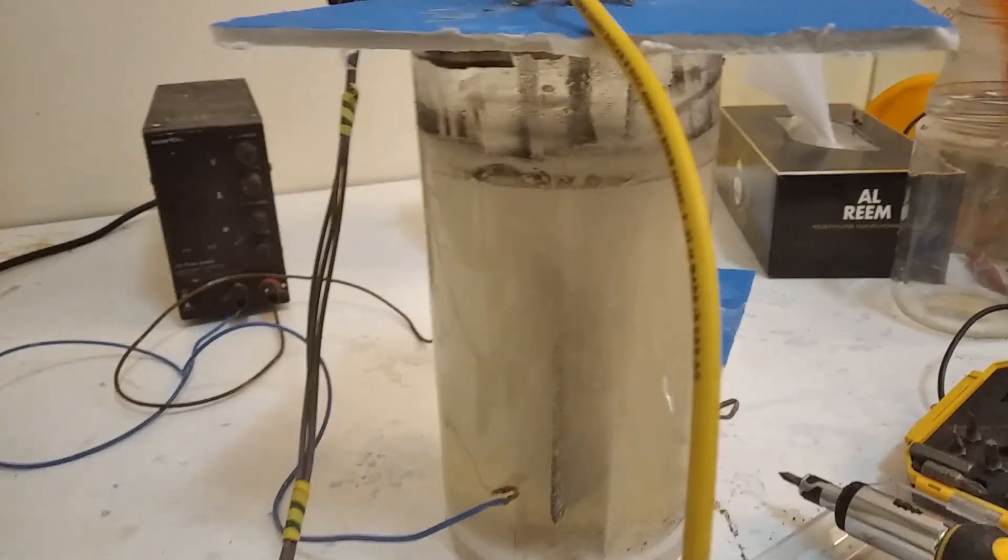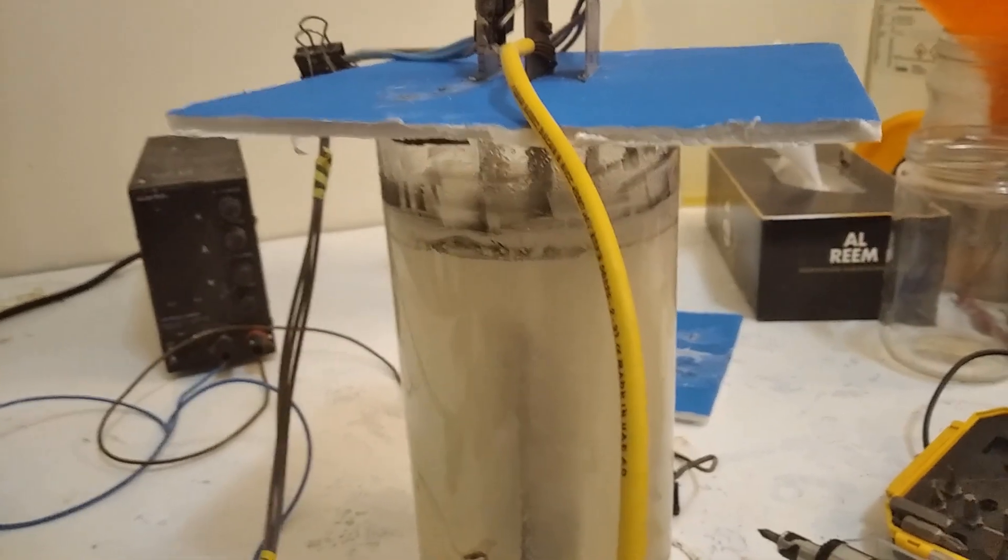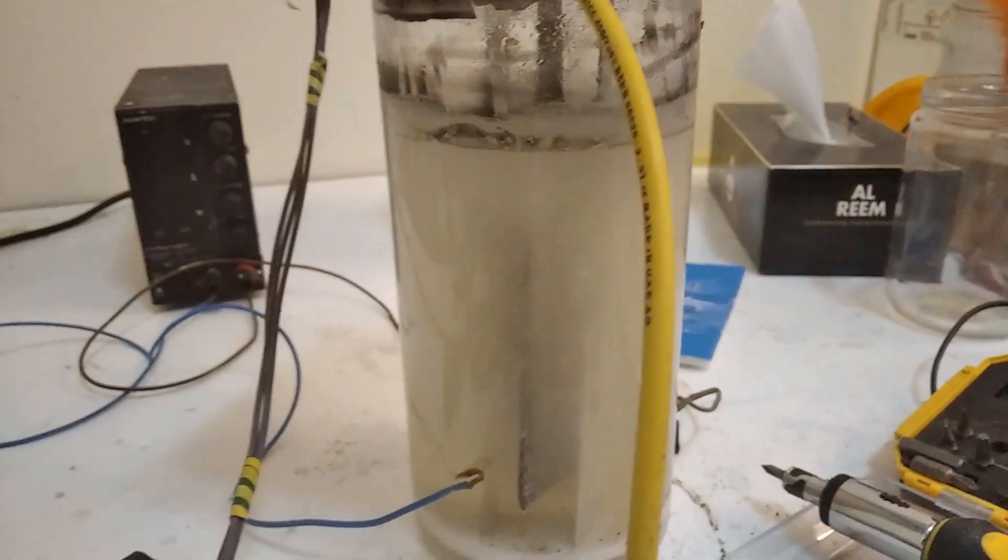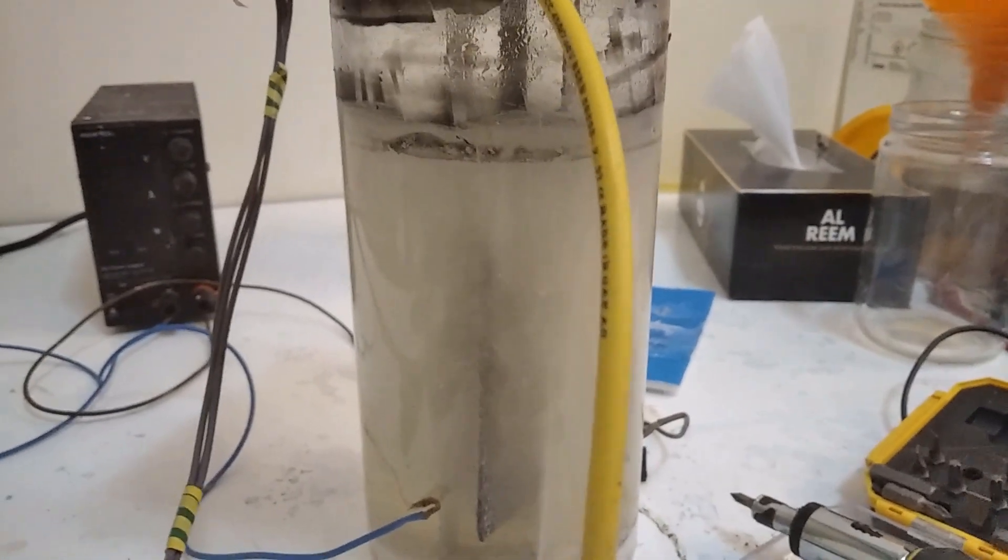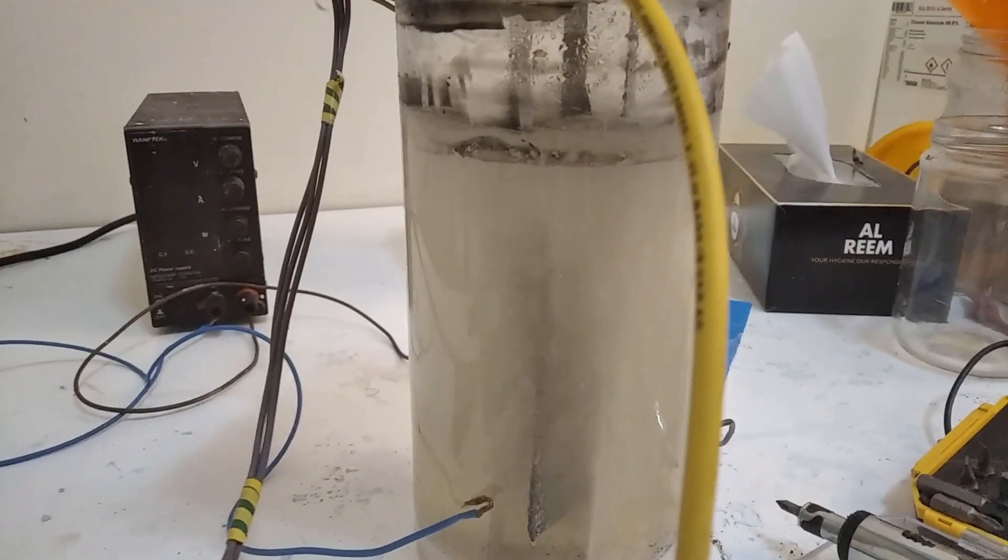I've set the current density correctly and this is a bleach solution. As you can see, unlike the sodium chloride solution where this would immediately turn brown, in this 54% efficient cell using bleach, it's not turning brown, which means that this is making chlorate.